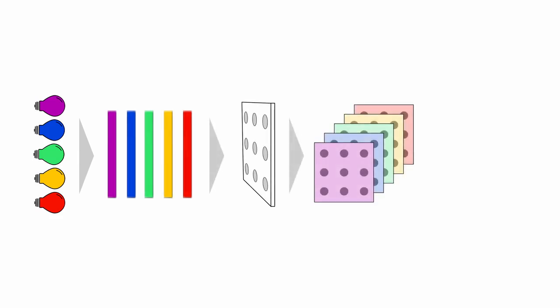simultaneously. The imaging process uses multiple narrowband light sources to scan a sensor composed of tens or hundreds of plasmonic nanostructure spots, each functionalized to bind to specific molecules. A monochrome camera captures the transmitted and incident light at each spot, across different wavelengths and time steps.